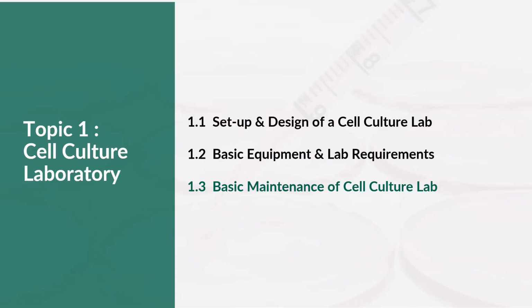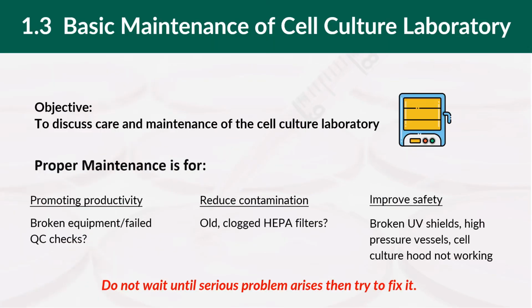Hello students, this lecture will cover the last point, which is 1.3 on basic maintenance of cell culture lab. The objective of 1.3, which is the basic maintenance of a cell culture lab, is to discuss the care and maintenance of the various equipments in the cell culture lab.